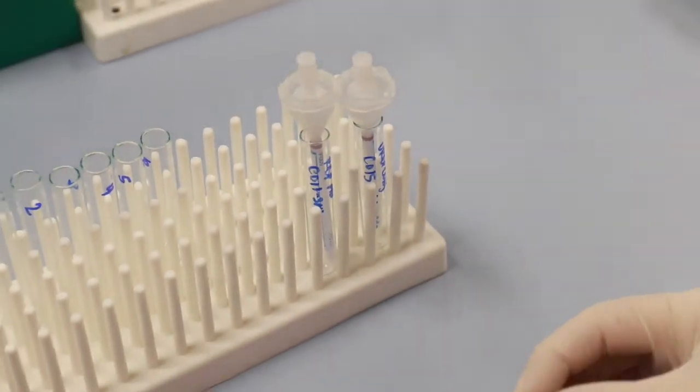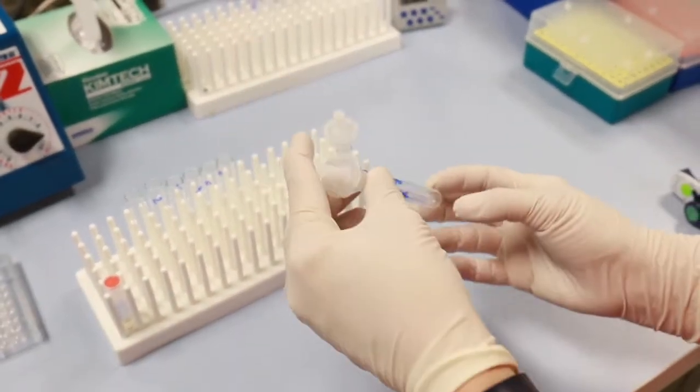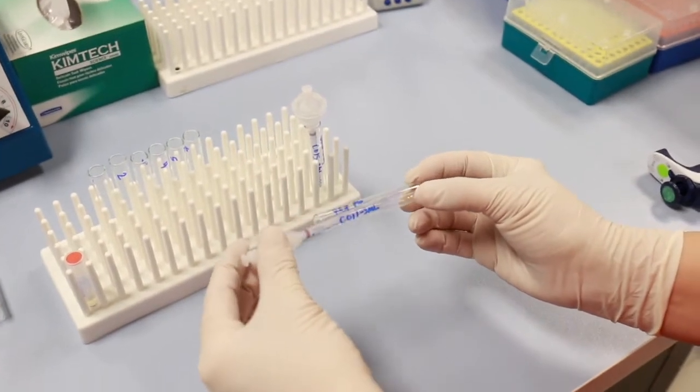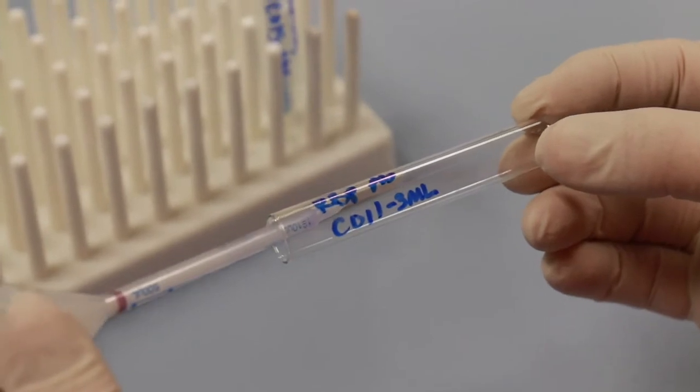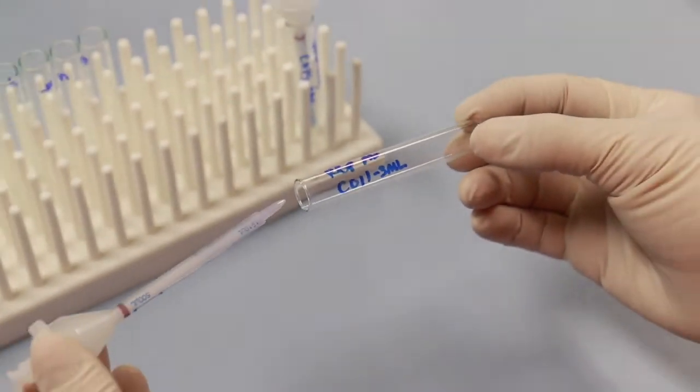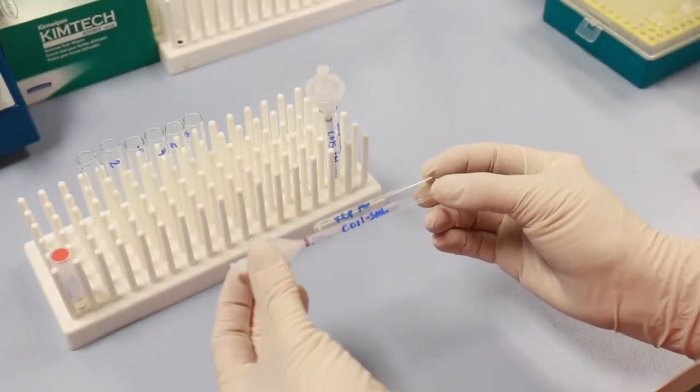We recommend the use of a repeater pipette when adding reagents to the kit. Label a test tube with the correct description or part number and store the tip for reuse.